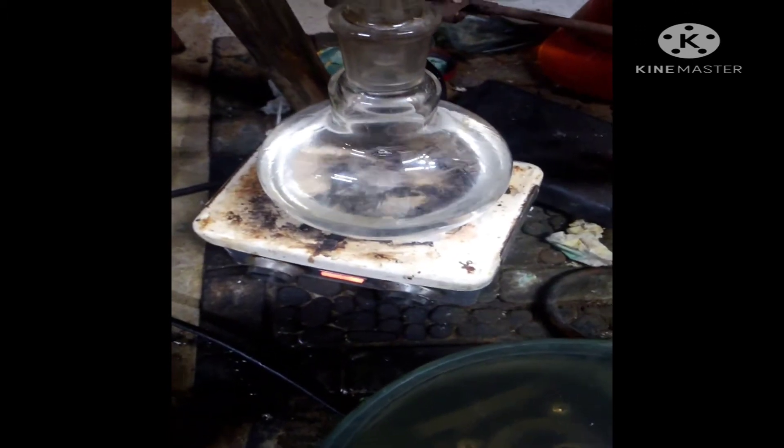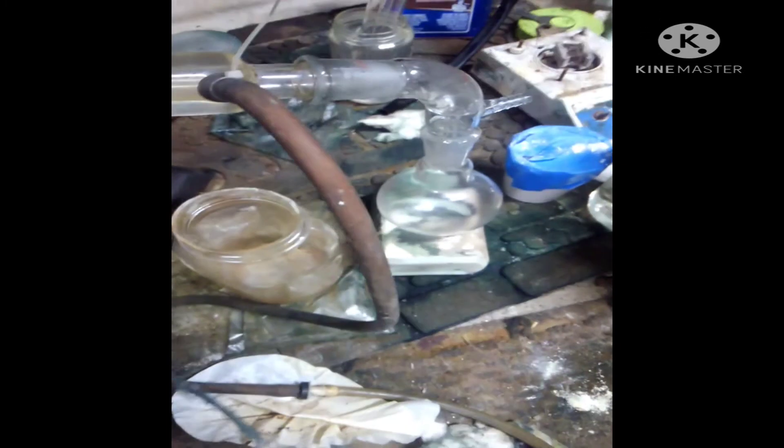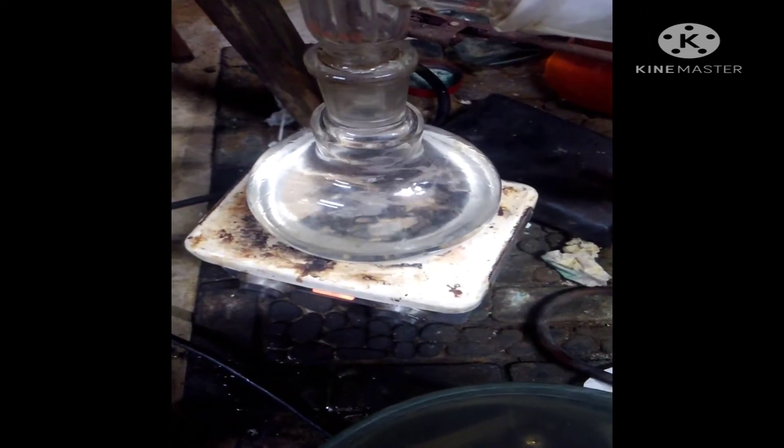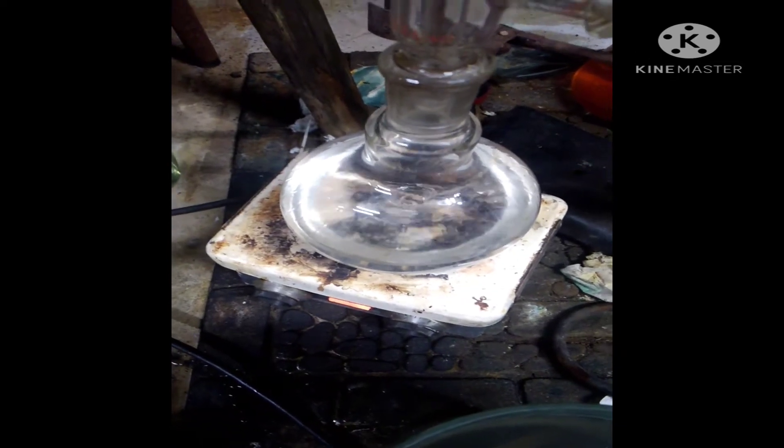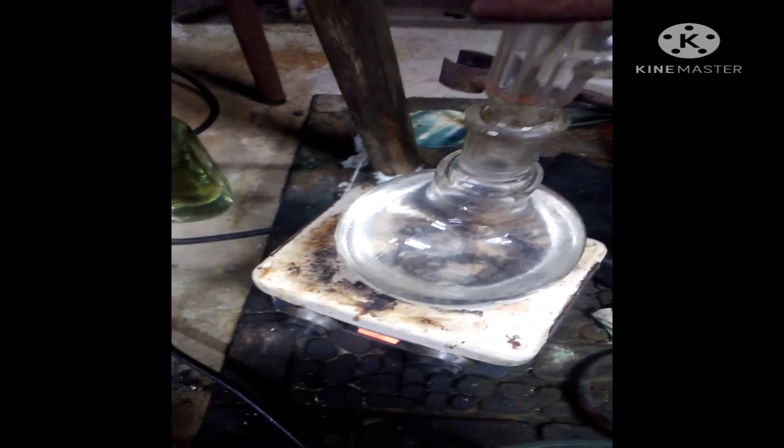I refluxed it for about 45 minutes and now I'm setting up for simple distillation. The boiling point of ethyl acetate is 77 degrees Celsius or 170 degrees Fahrenheit, and that's what I'll be collecting at. Only half of this will be ethyl acetate and half will be water, so out of the 500 or 600 milliliters of solution I have, I'll get about 300 milliliters of ethyl acetate if it goes properly.